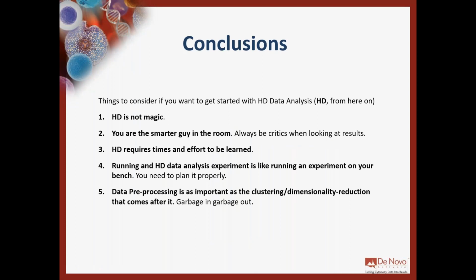So take your time to plan the experiment, take your time to plan the pre-processing. And again, there is much more to tell about all the algorithms: tSNE, UMAP, FlowSOM, phenograph, whatever. We have a lot of material already present on our website, both as video material and also as textual material in the manual.